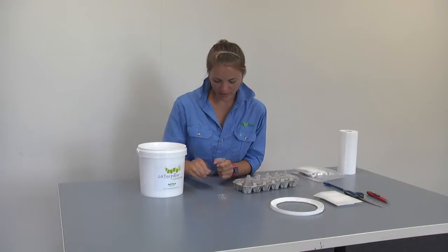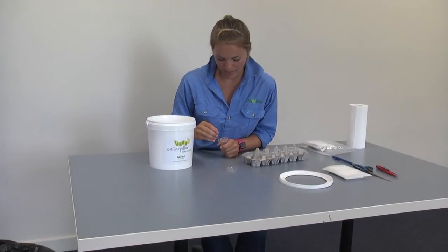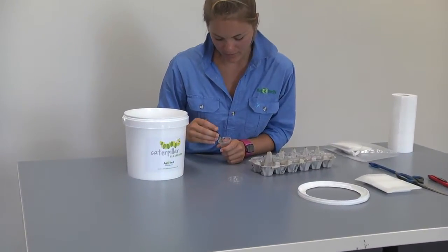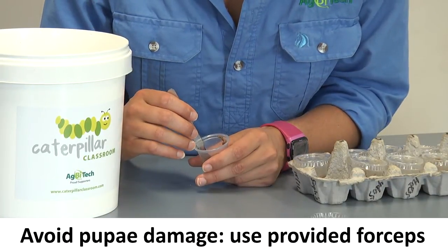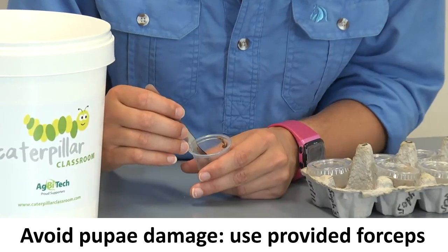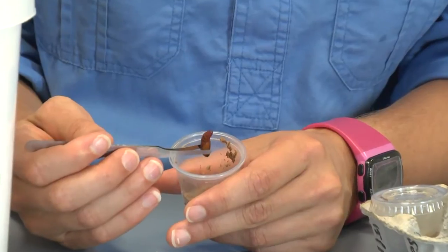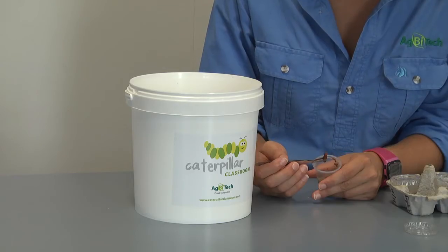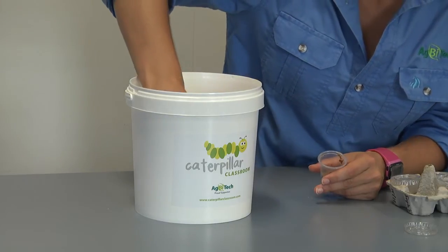Take a cup, remove the lid, and because the pupa buries to the bottom of the cup you may need to scrape away some diet to reveal your pupa. Pick up the pupa with the featherlight forceps so that you don't damage it. You'll be able to see if your pupa is alive because its tail will wiggle. If your pupa is alive, place it at the bottom of the bucket on top of the paper towel. Repeat this process until you have transferred all healthy pupae, and discard any dead or deformed pupae.